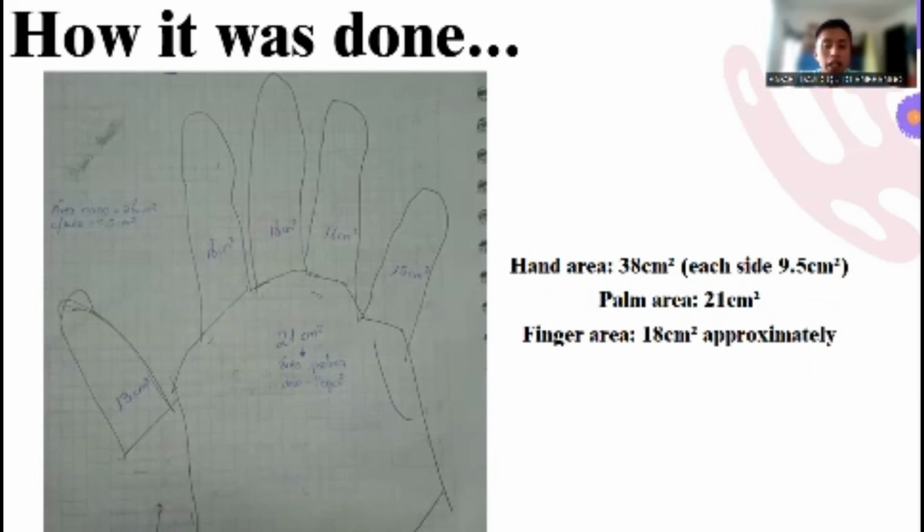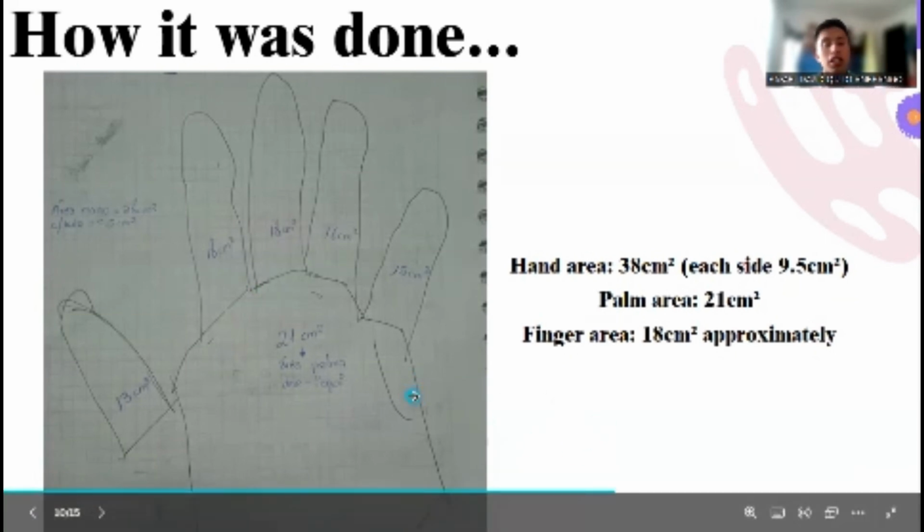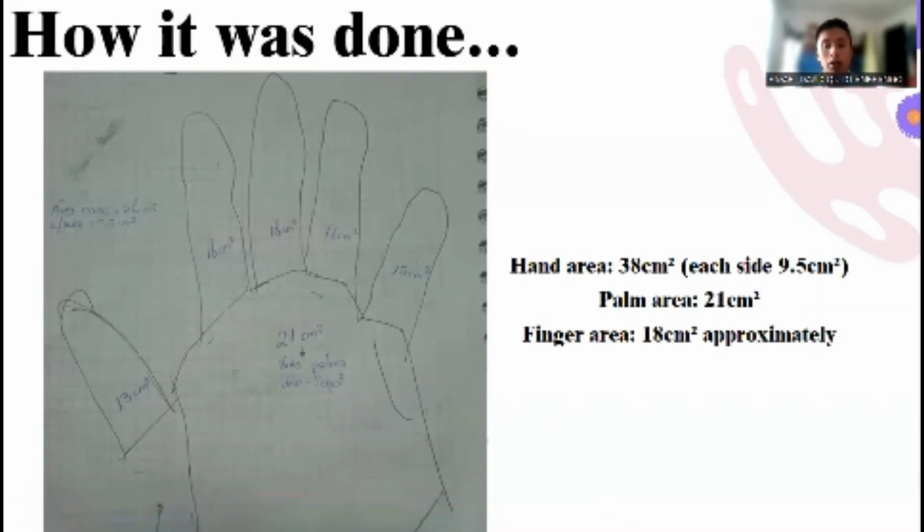In the case of the isolation in the right hand, the area of each finger was considered part of the total area. Likewise, the area of the palm was considered for the right hand. In this drawing only one hand is drawn, but it is considered for both the right hand and the left hand. It should be mentioned that a single drawing of the hand was used, considering that the areas do not vary.